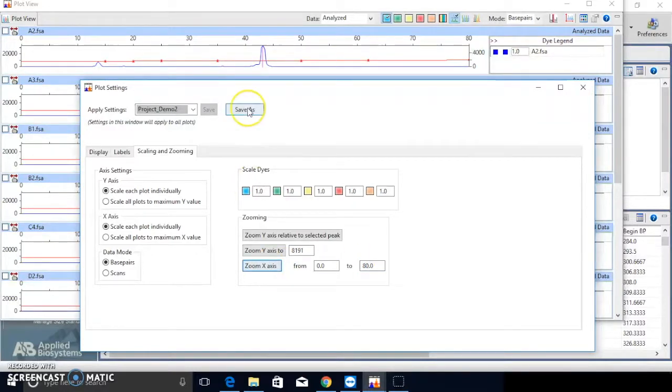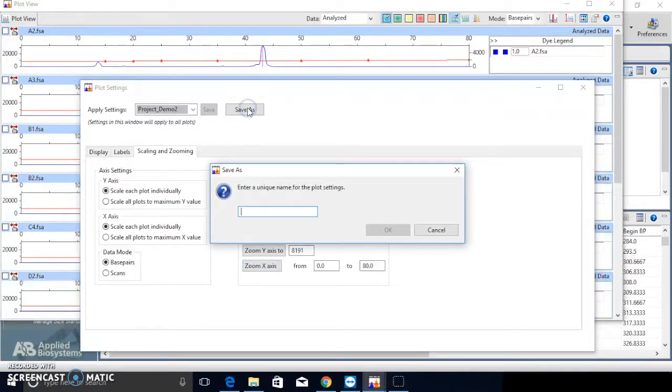Click Save as to save all updates in a new file. Then next time, you can choose the file to view the plot.